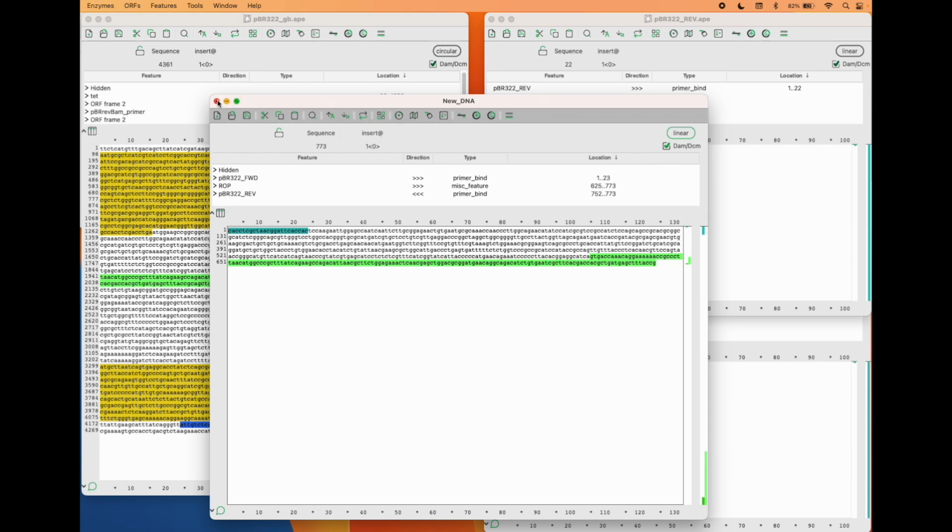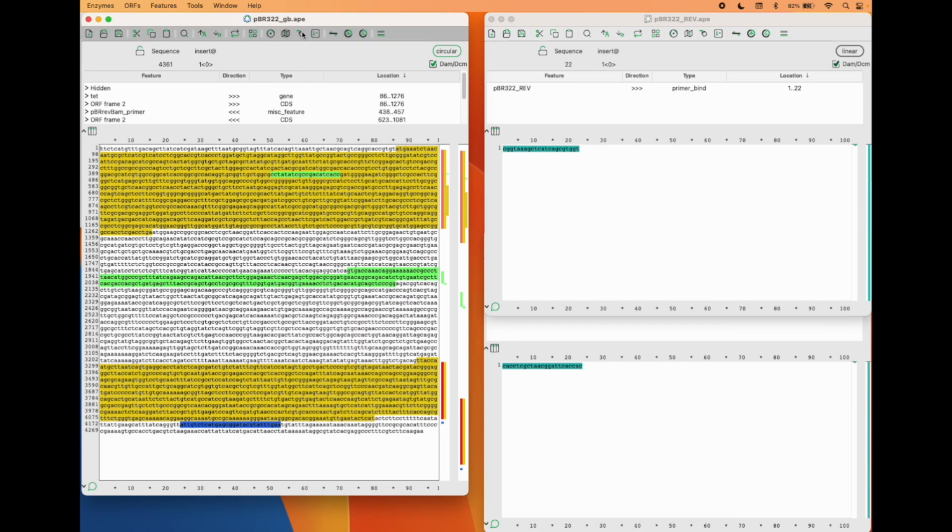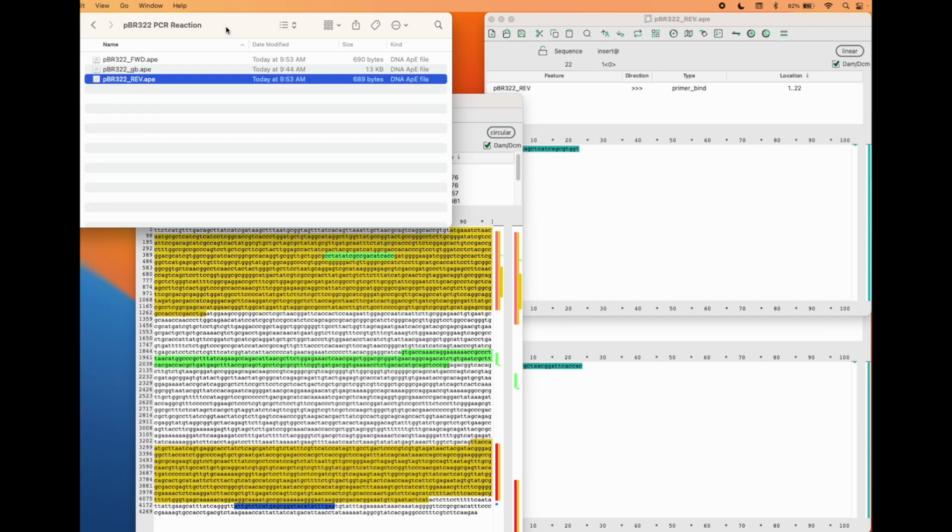All right, so with that, we can stop and you can move on to doing the modeling of your other PCR reaction. So this would be the pUC19 reaction. And with those two, you'll know what the two fragment sizes should be within your PCR-it Kit reactions.